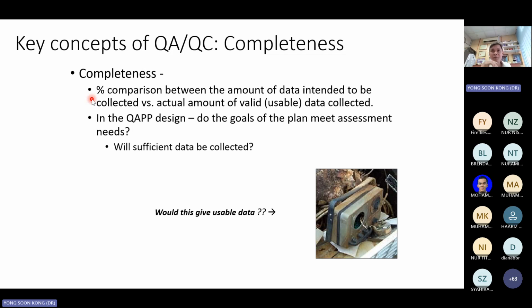I don't mind you cut down the number of samples provided that you have a very good reason, like for example, safety. But for this one, the completeness here is very much part of the QA/QC because we know some of the samples might not be valid and you have to discard. Air keruh is one example. If air keruh, no point, because it doesn't represent the original state of that river, because raining only happens just once. Then after that, air dah keruh. If that day is raining heavy, we are not supposed to proceed with the field trip sebenarnya. We have to cancel.